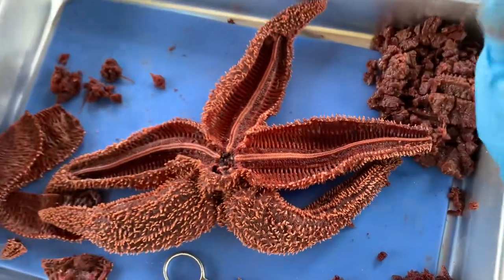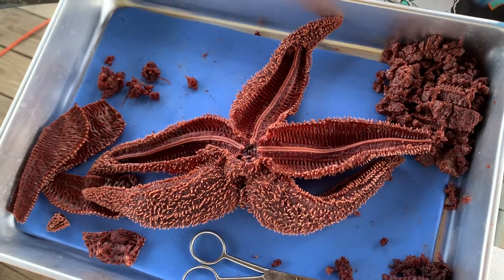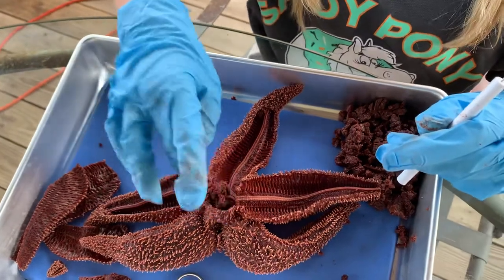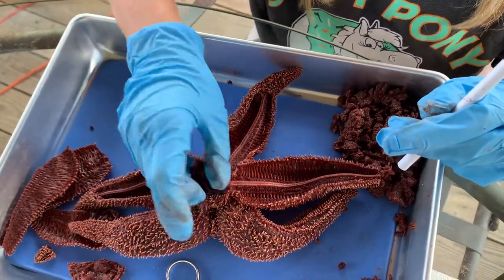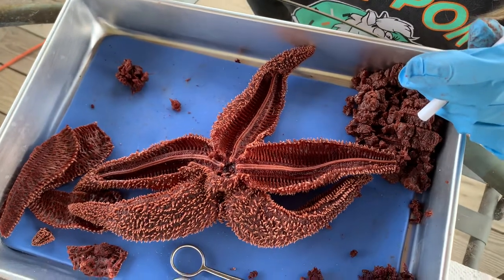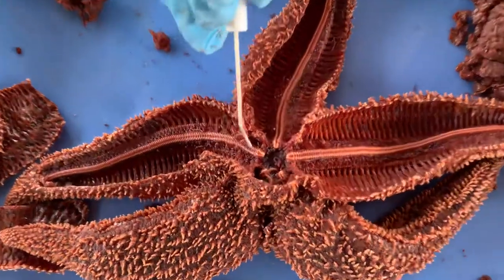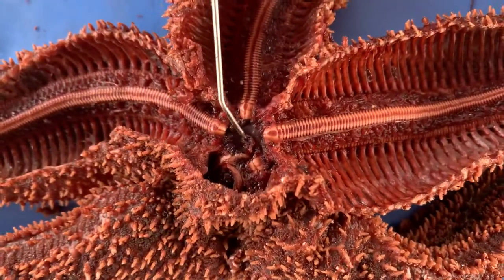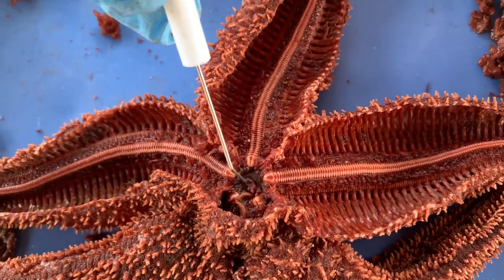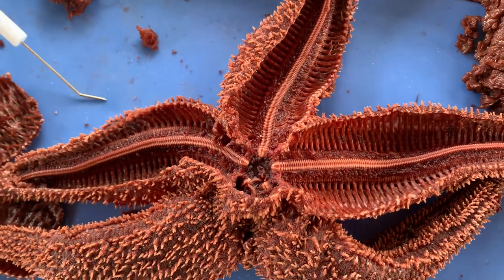The cardiac stomach — I want to correct myself. In the last video, I said that this, which was placed around there at the time, was the cardiac stomach. I am sorry about that. That is actually the pyloric stomach. This is the cardiac stomach, and that's the little canal where the food is transferred to the pyloric stomach.